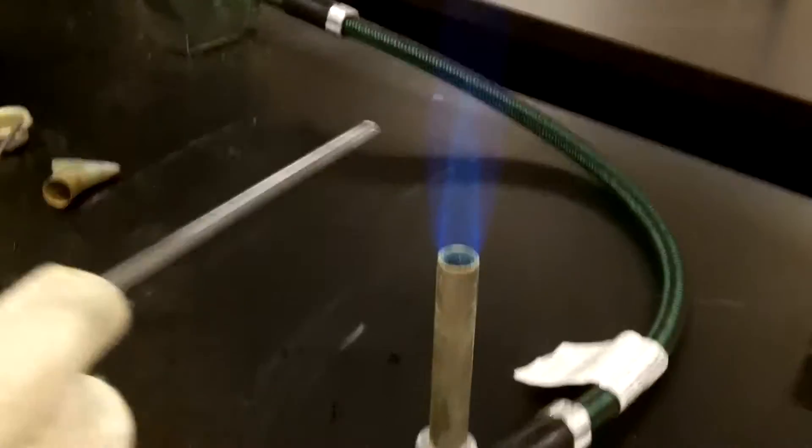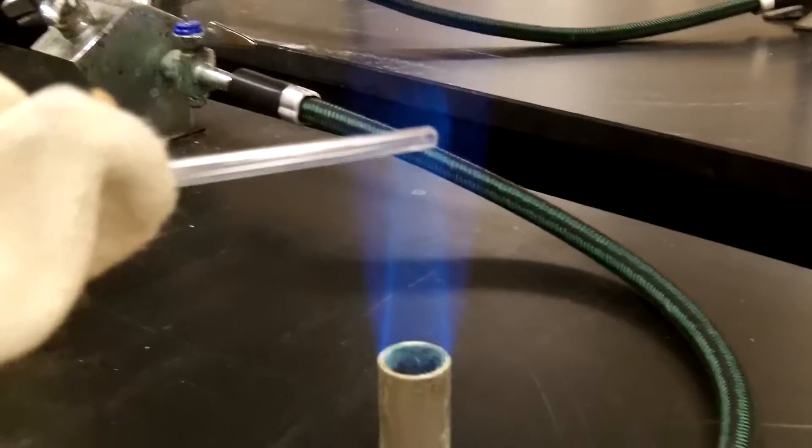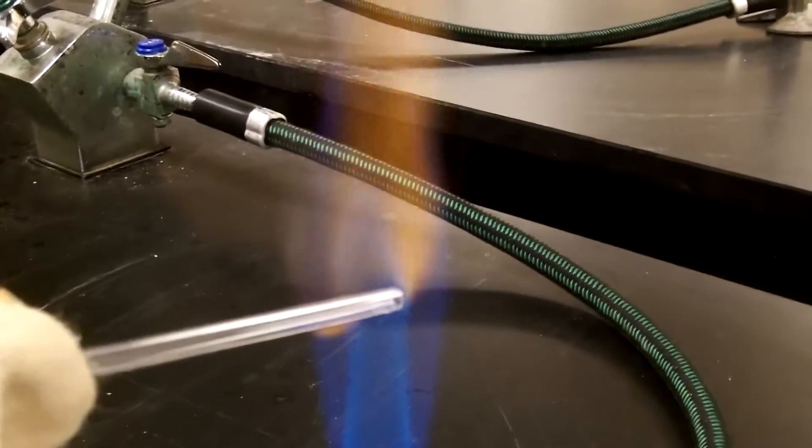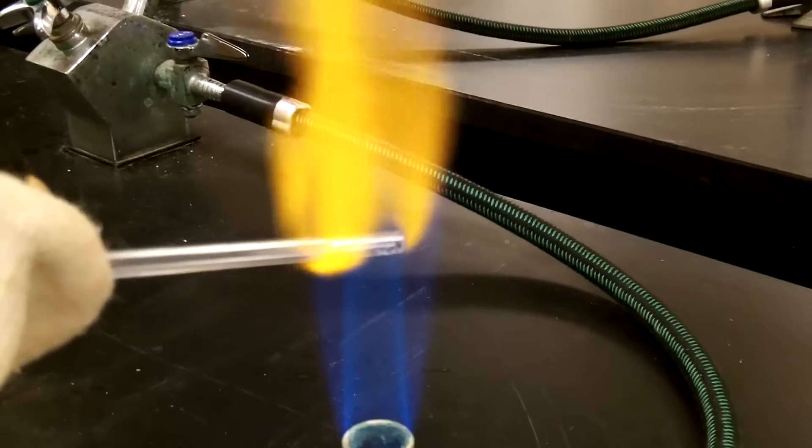Now, pick up your glass tubing and put the tip on the inner cone of the flame where it is the hottest. Rotate it slowly to get all sides heated evenly in the flame. When it is done, you will see that the end looks polished and clean.